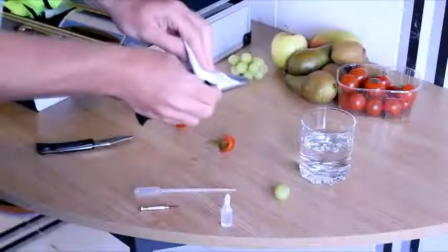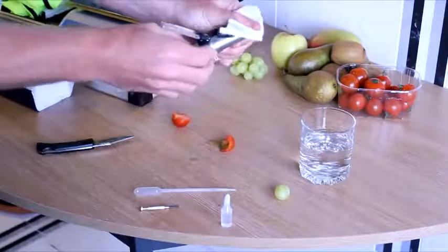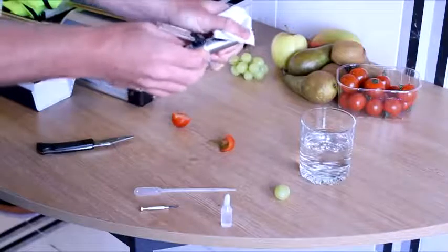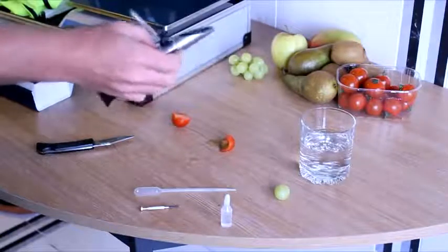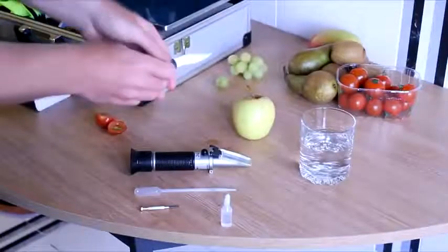Looking through the viewport on the other end of the refractometer, you can then take your reading using the scale provided. Always clean the plate thoroughly of any residual juice in between samples, and to avoid anomalous samples, we always recommend taking a range of readings from within any batch.